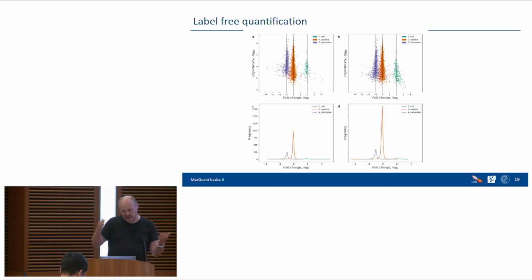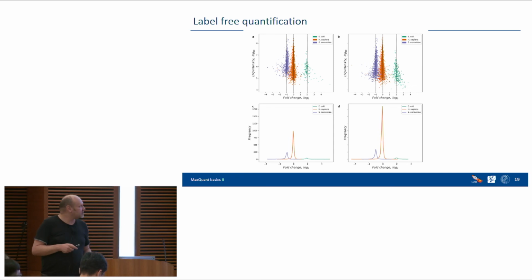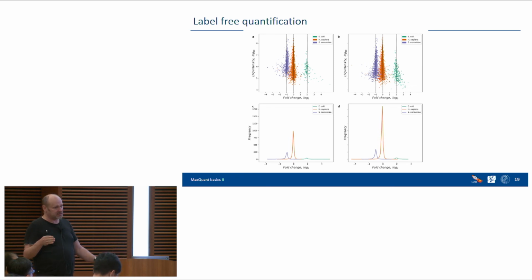Right, and then we applied label-free quantification. So that's a 3 species setup that you might know from other studies, where you have replicates, and each of these replicates is a mixture of 3 species, and then you have 2 replicate groups, and you know that between these replicate groups, each species should have a certain ratio. I think this has been done in a couple of contexts already.